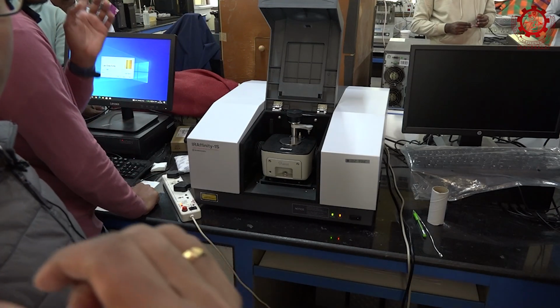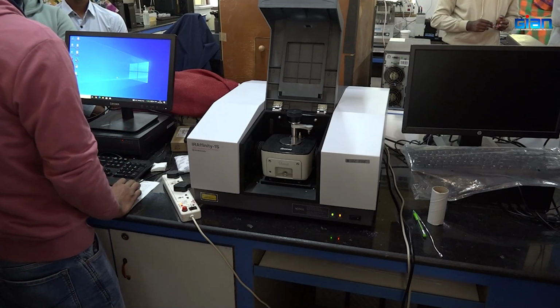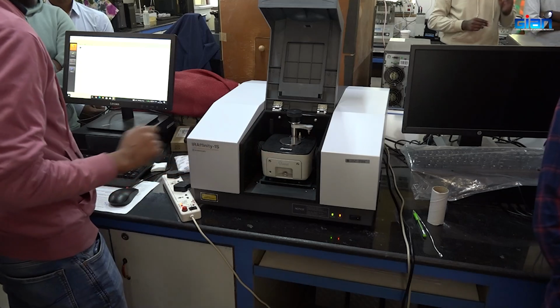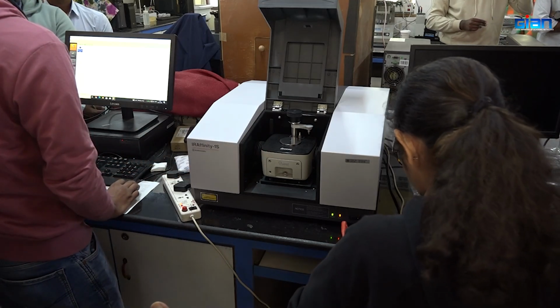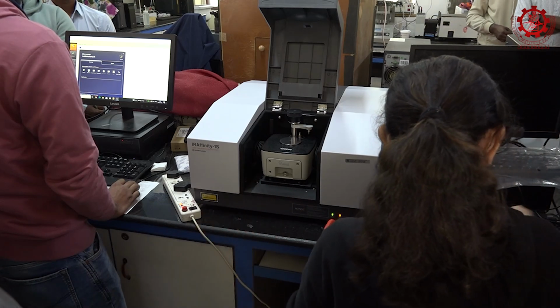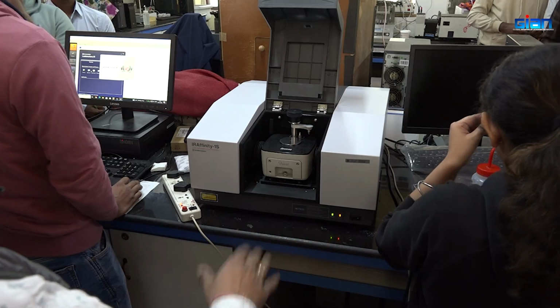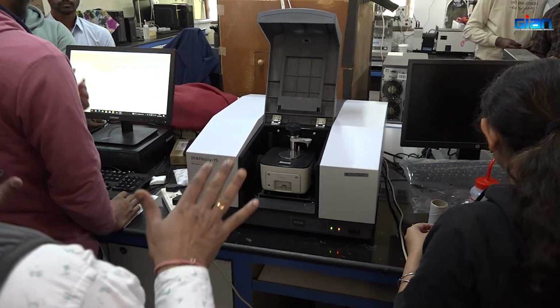Am I covering this one? Oh, sorry. Okay, so she is my PhD student, Ms. Sukanya Mandal. She got 2 samples, because we also did that experiment yesterday to see that everything is working fine.